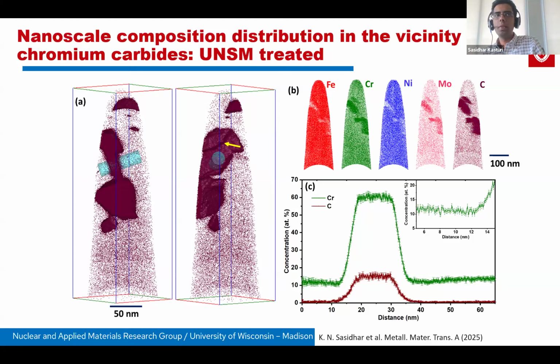It's not one psi angle, but a range, and you can go as high as it allows. As you go to increasing psi angles, the measured X-ray counts decrease, but typically you can go from 0 until about 70 degrees or so. Then you plot the interplanar spacing as a function of the psi angle, D versus sine squared psi, and there's a method to calculate the residual stress from that. That's a standard calculation.